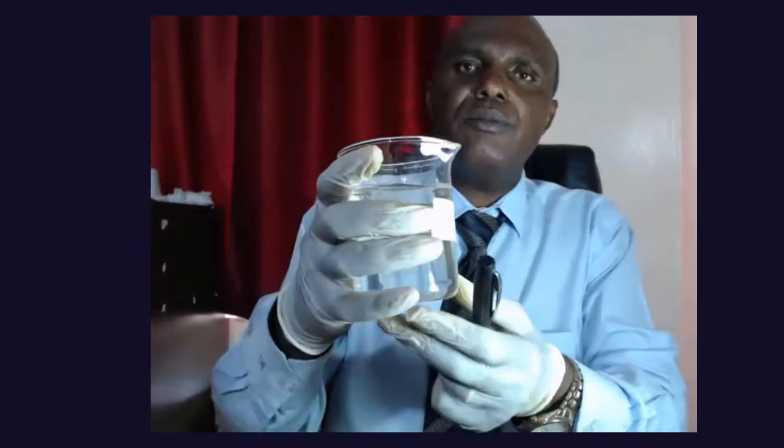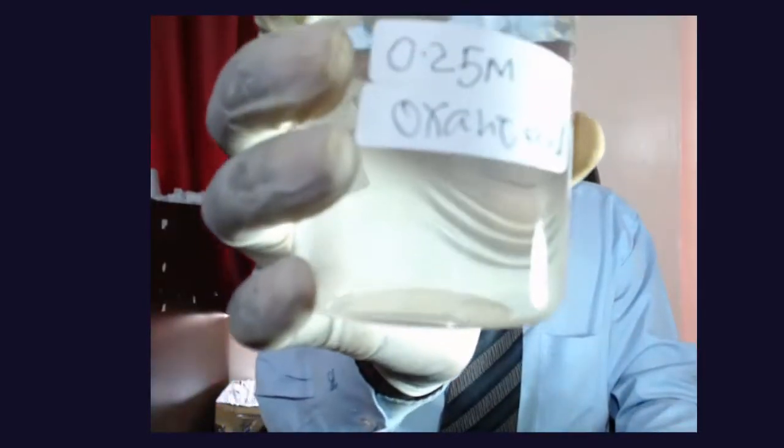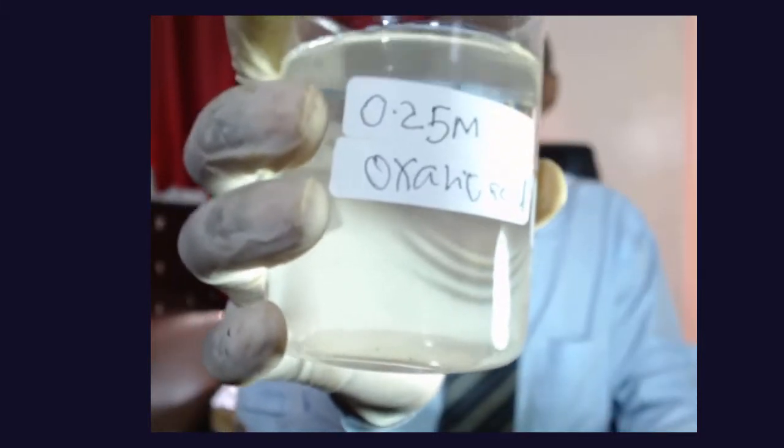we prepared a solution of oxalic acid, 0.25 M, and we have a solution of sodium hydroxide. This solution, its concentration is unknown.